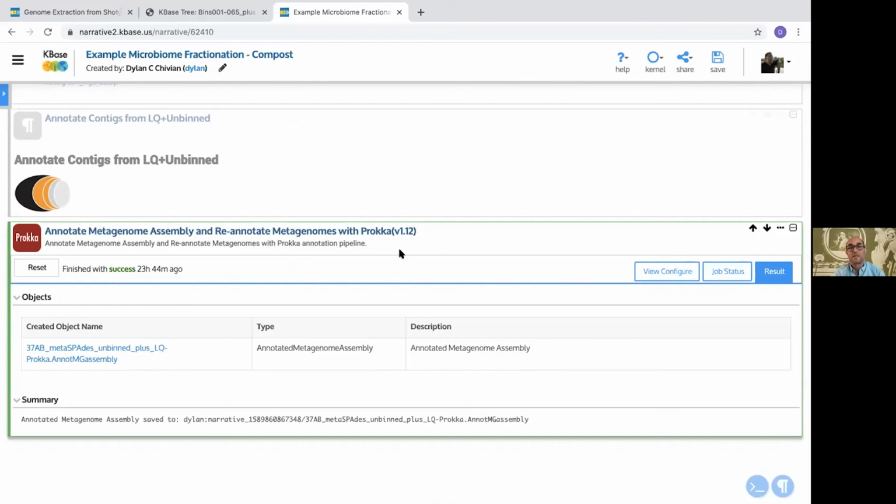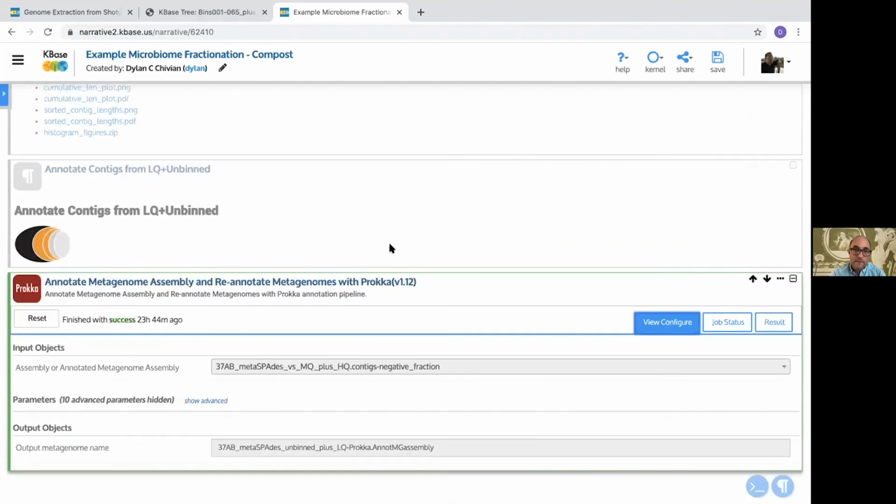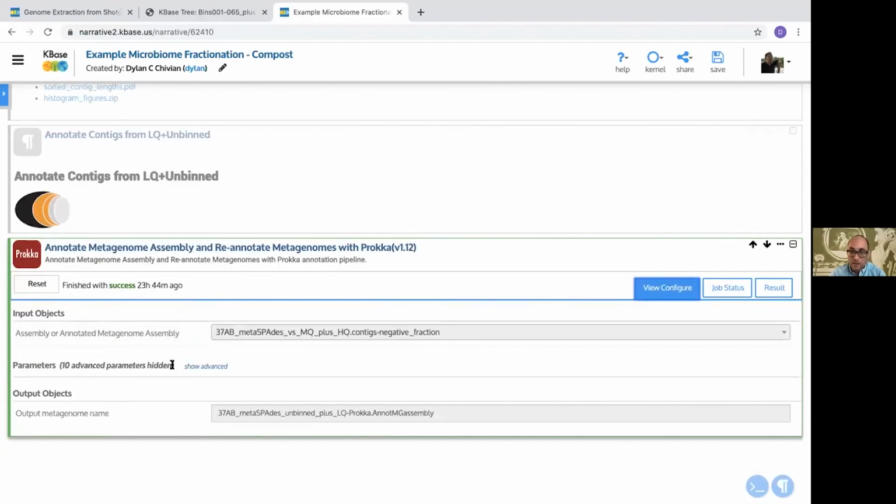And then what's left, do the metagenome annotation to get these contigs annotated. And so then you can deal with this fraction and obtain the value from it, which is significant, but, like I keep saying, with the high quality MAGs you can get more out of them. But we still want to get stuff from this.